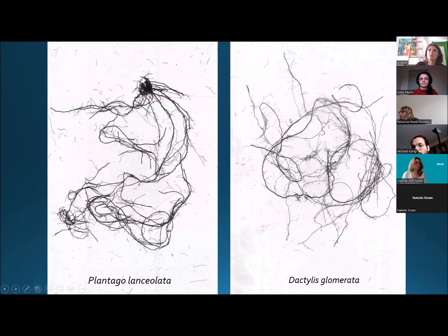And this is a negative example, because if there are air bubbles within the scanner, or if there's some water on the glass above, then the scan will not be good enough, and the program will definitely not be able to detect the roots here and analyze them correctly.